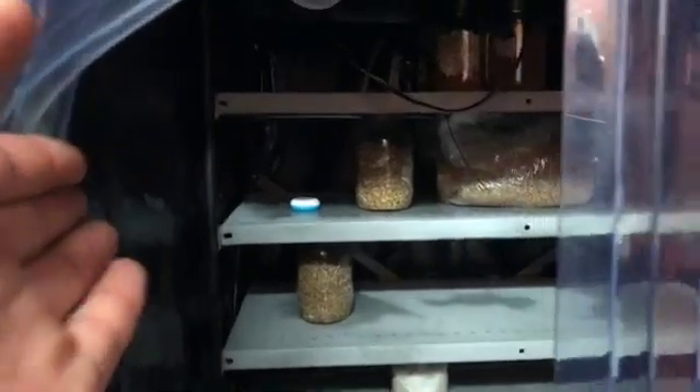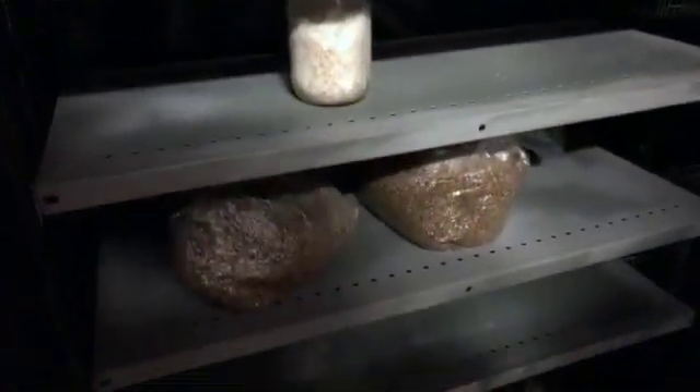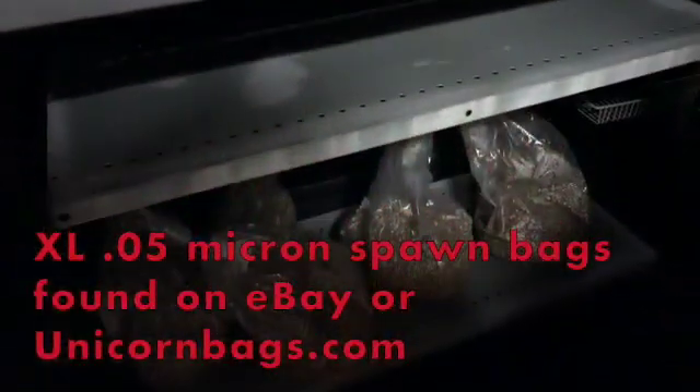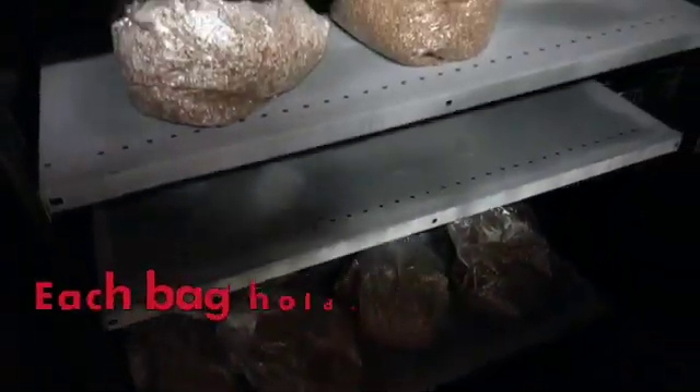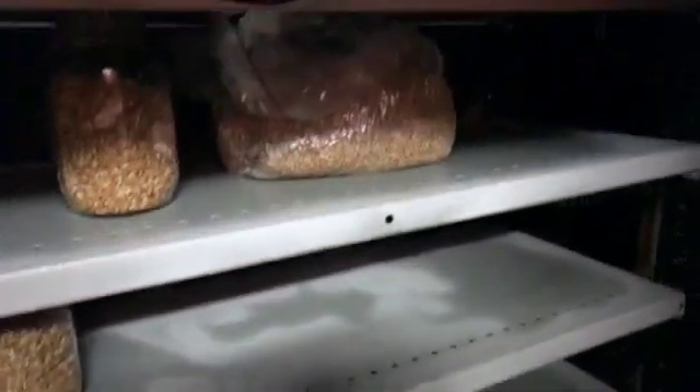Entering the spawn room — the light bulb's out right now, but we don't need light in here. This is where we keep all of our inoculated spawn for it to fully colonize the bags. This is a bunch of oyster mushroom; we have a couple different varieties of oysters that we're growing right now, as well as some lion's mane and other stuff.